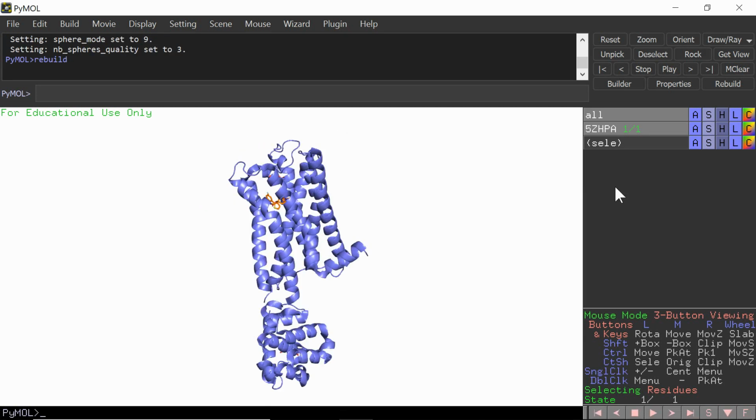Here you will notice the pose chosen is pretty similar to that of the literature. This will not always be the case, however in this instance it's a pretty useful and descriptive pose.